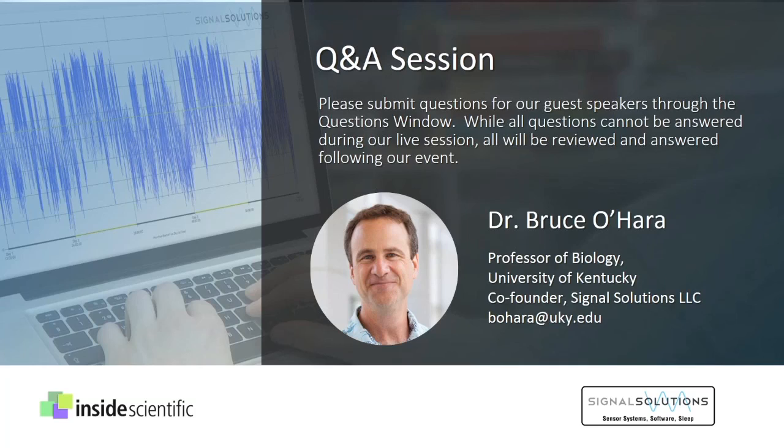Yeah, that's been a big concern of ours over the years. We think the filtering and amplification we do really accentuates the key signal we need to distinguish sleep-wake. That being said, some rooms are noisier than others, so it is good to have as quiet a room as possible. Even when people walk in a room to check on mice, that's usually only a matter of minutes out of a 24-hour day. So over a 24-hour period, we find the data usually isn't impacted much for most sleep variables. Or if it's a really severe interruption, we can even eliminate that period.